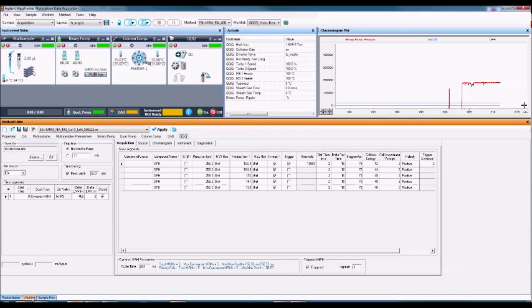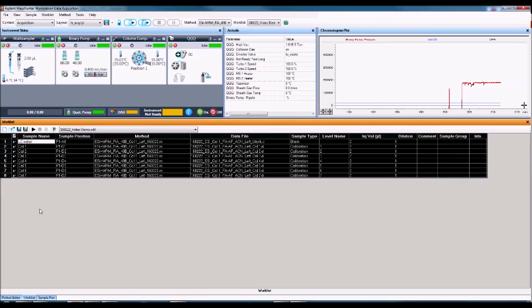And over here I started to prepare a work list. So I'm going to start this work list. This is the name of the method that I just created. This is the name of the work list, video demo. And I'm going to start that.